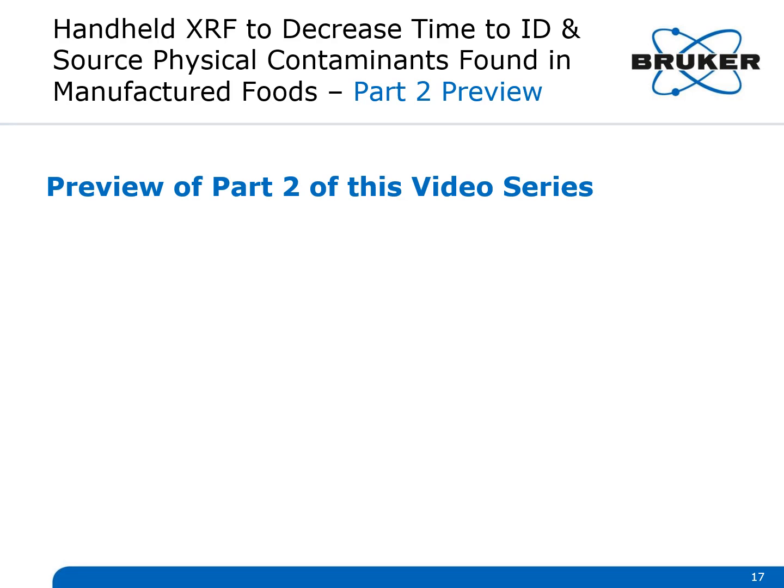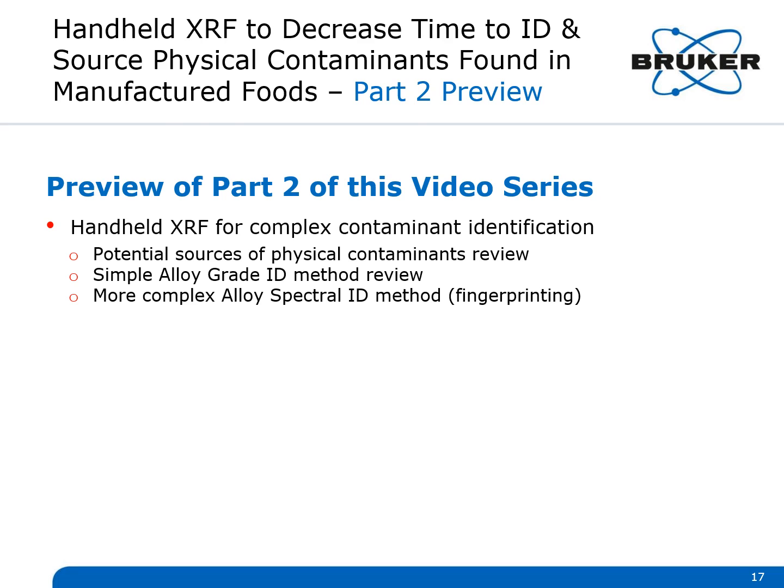Now we'd like to give you a preview of part 2 of this video series. We will be discussing handheld XRF for the more complex contaminant identification situation, which arises when there are multiple potential sources of the contaminant alloy on the production floor. We'll first review potential sources of physical contaminants. We'll then review the simple alloy grade ID method presented today.